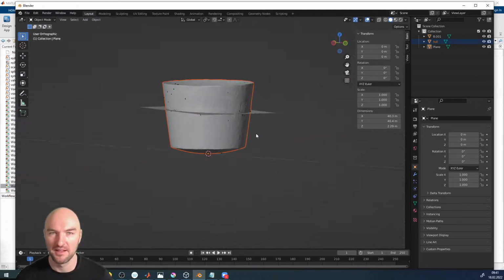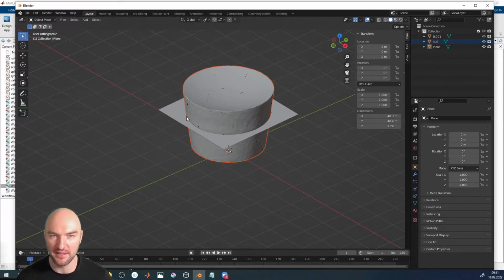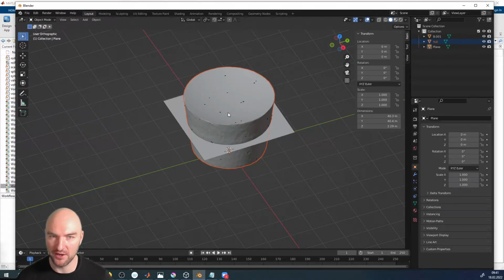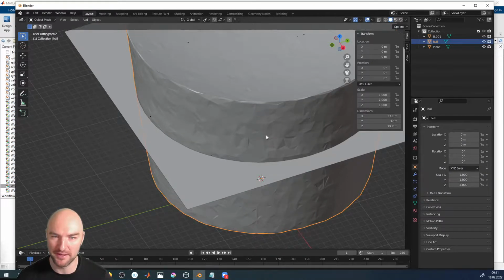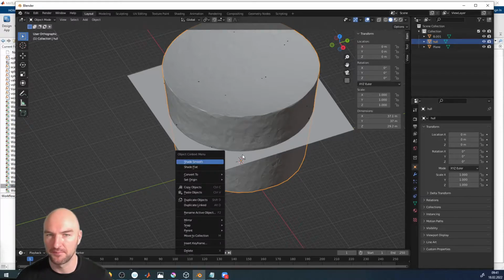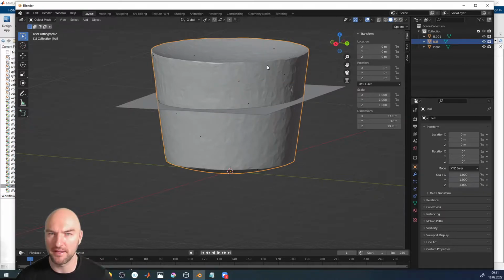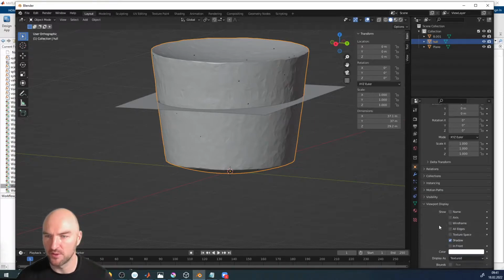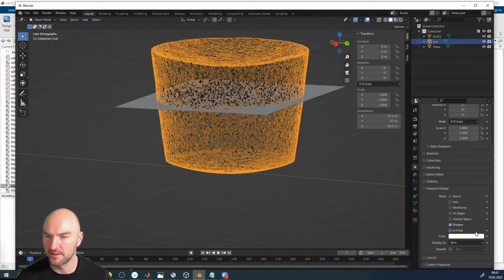Okay. Anyway, so now we actually have a measure. We have an object that tells us where our data set ends. You can see it's a semi nice looking mesh here, and here we've got our object. I'm gonna make that semi-transparent. So I can go to the object properties, viewport display, and I want to display it as a wire object.